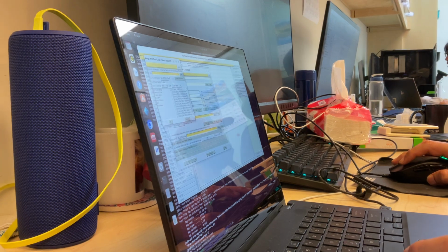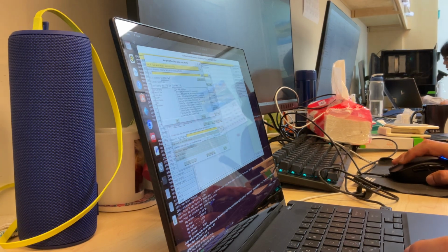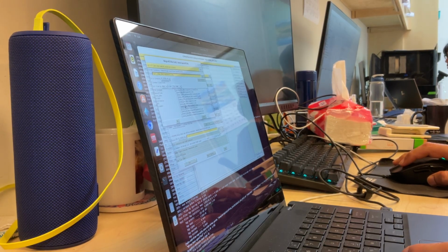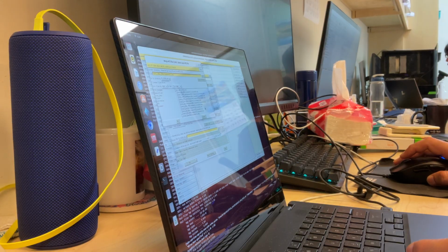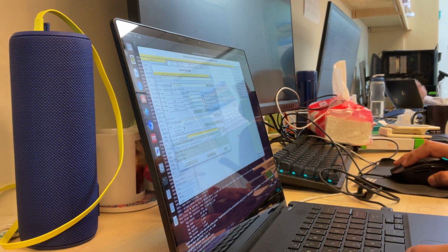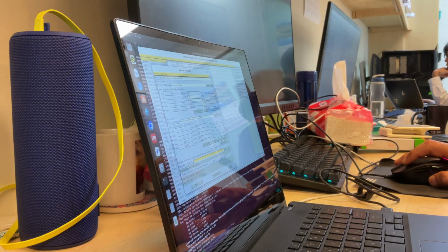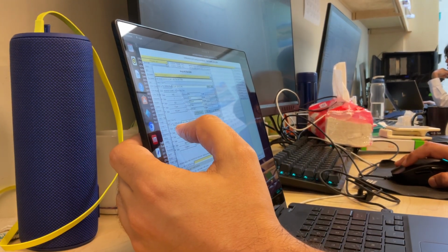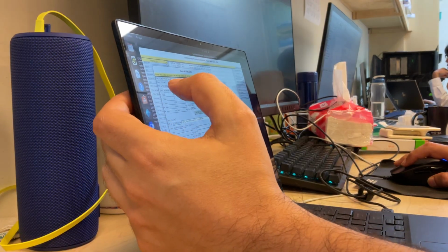The second one will be the 180 picosecond one, but it needs to be the truncated one. So 180 picoseconds truncated, this one. Now we go for selected columns, list all columns, and now we cannot have a double free. The system will only accept one.